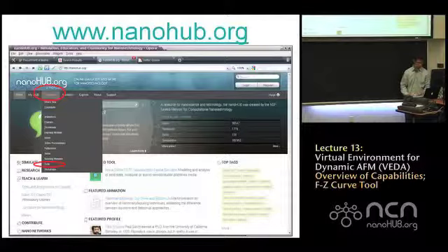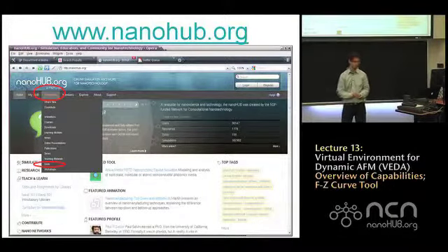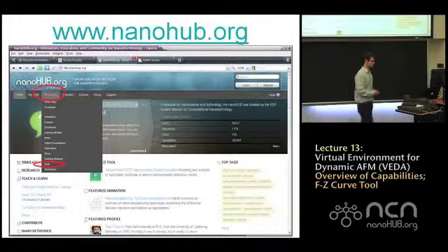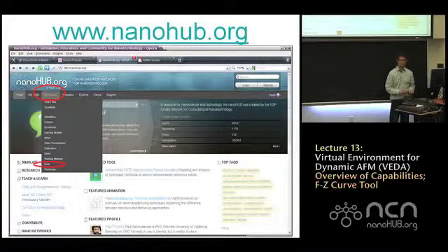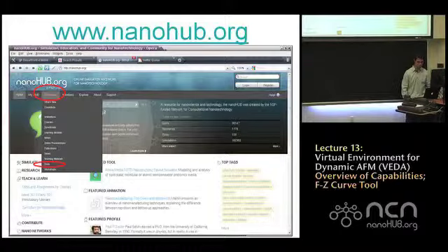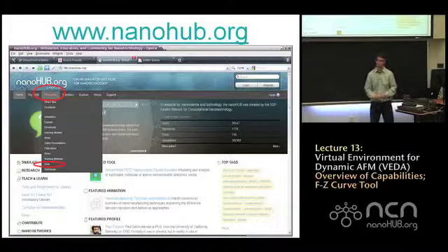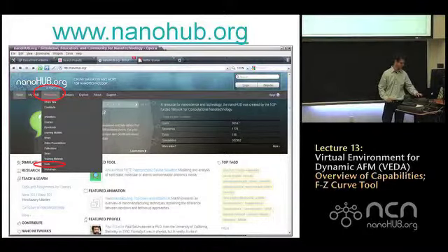Okay, so with that, if you guys are on nanohub.org, the first step is to locate VEDA's website, or the page for VEDA. And to do that, if we go to resources, you'll see there's a drop-down menu which lists several resources on VEDA, such as lectures and notes and presentations and so forth. And among those is tools, which is where all the simulation tools are located. So we'll select that.